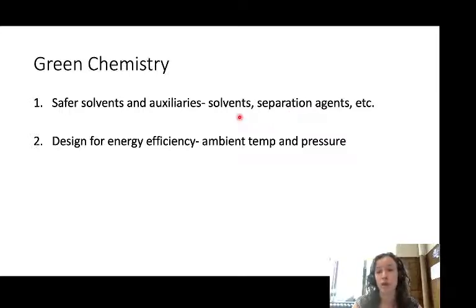This week we're using vegetable oil and methanol, both pretty non-toxic materials. Vegetable oil we ingest probably on a daily basis. Methanol is toxic upon ingestion. However, it is not that toxic to work with. Sodium hydroxide is corrosive, but in the way we work with it in the lab, and considering we don't use very much of it, it's a pretty good catalyst to use.